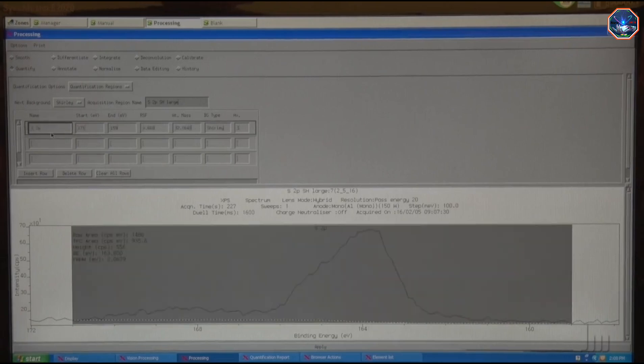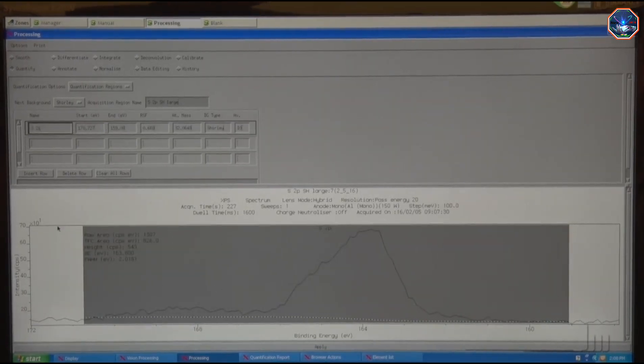In order to determine how much of each form of sulfur is present, we will need to do some peak fitting within the analysis software.